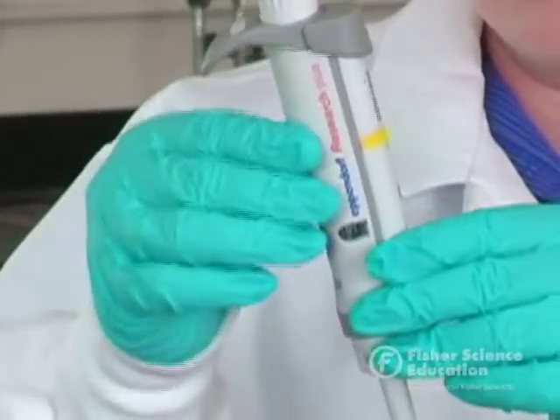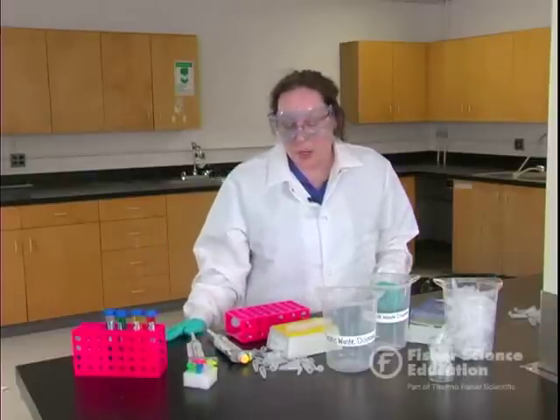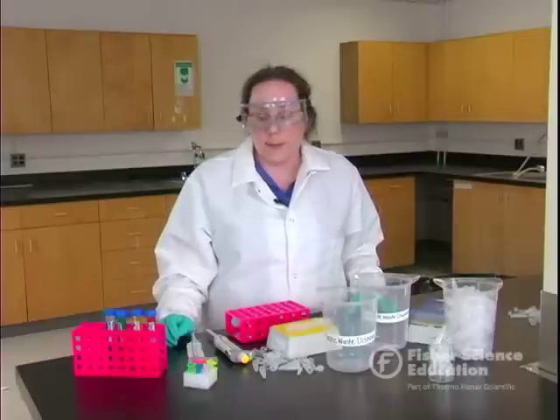These are a really great tool. They're used in research labs, forensic labs, chemistry labs — any kind of lab in the world is going to use these air displacement pipettes. I'm going to show you how they work, how to use them, and talk about some common errors that students may have and how to fix them.